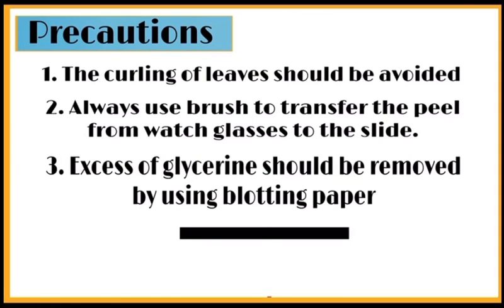Precautions to be taken. First, the curling of leaves should be avoided. Number 2, always use brush to transfer the peel from watch glasses to the slide. Third, excess of glycerin should be removed by using blotting paper.